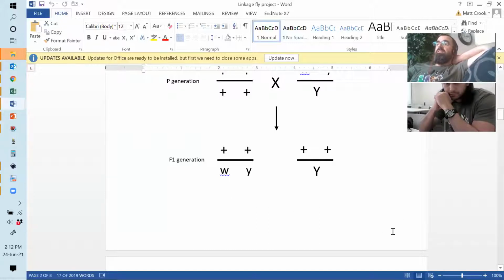What linkage phase are these females? A little bit of quizzing you from stuff today. Yay, they're in cis linkage. Good stuff, Maria. And you get wild type males. These ones we virtually kill.